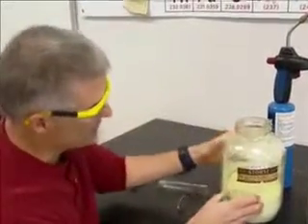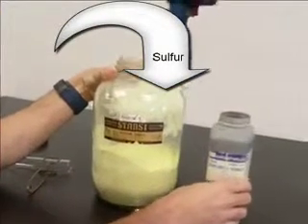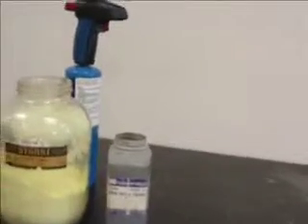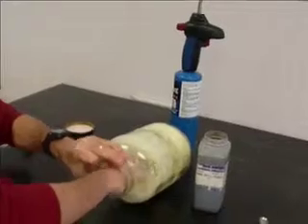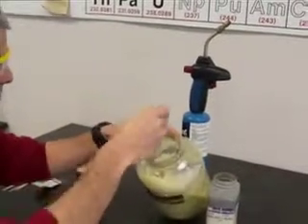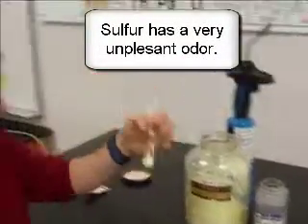All right, the reaction I'm going to work with is I have sulfur, elemental sulfur, right here, S. I think it's S8, isn't it, Mr. Sanders? It is. And I have iron metal. Okay, so what I'm going to do is take this test tube and put some of my sulfur in. This is one honking thing of sulfur, isn't it, Mr. Sanders? That is, but it smells lovely, doesn't it? All right, so I have some sulfur in there.